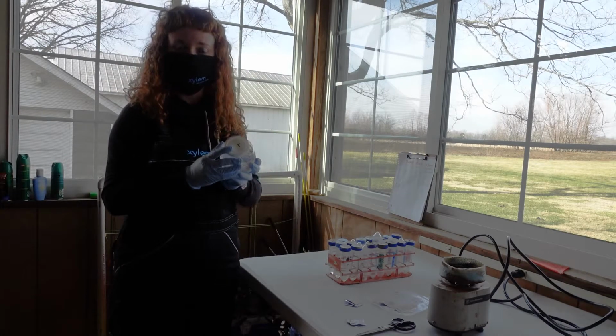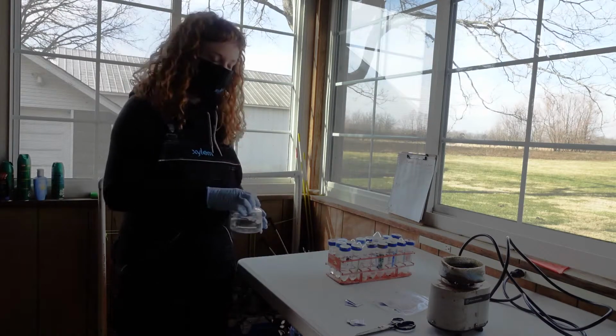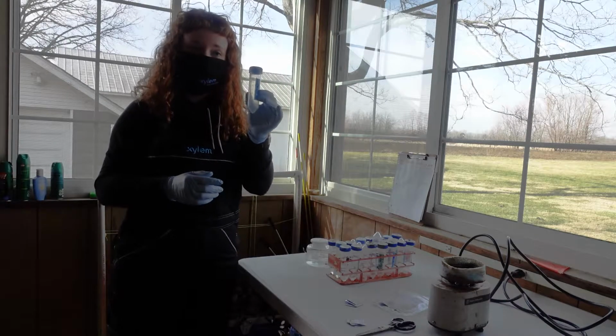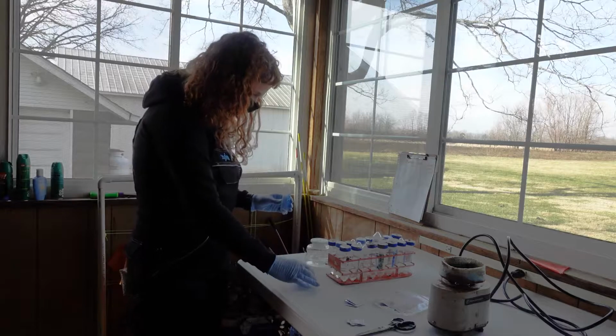So here's an example. This is a field sample labeled number 1. All right, that's my sample number 1. So what I'm going to do is take my empty tube labeled number 1. I'll take off the cap.